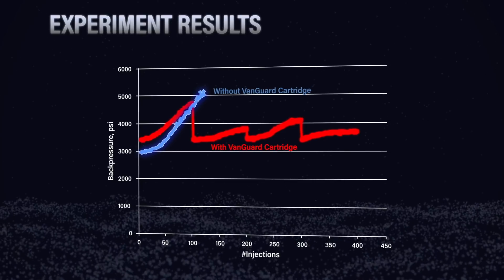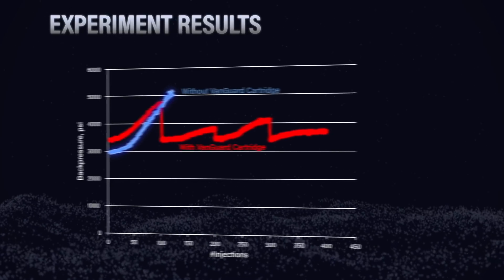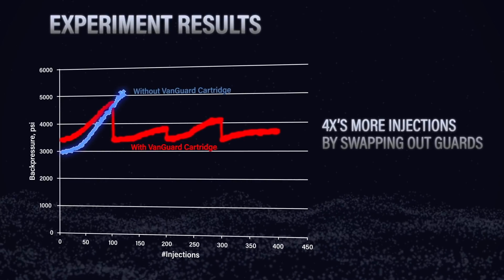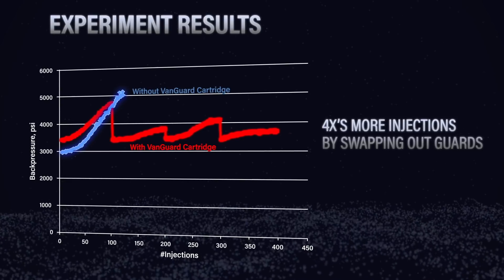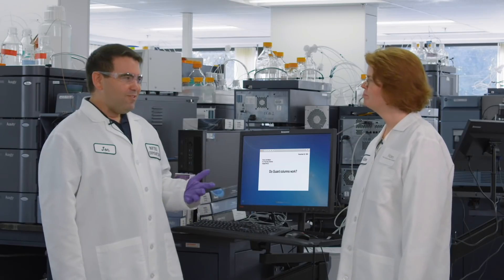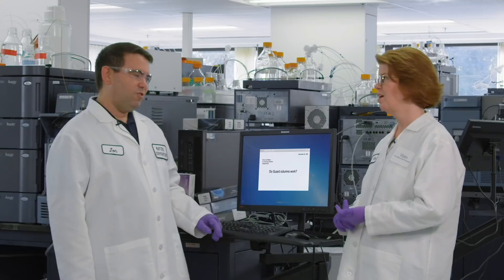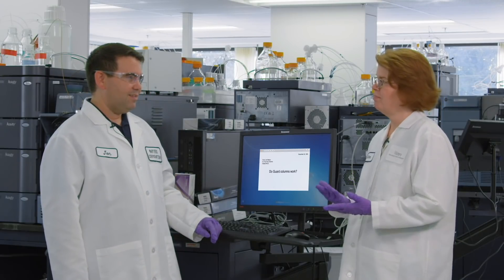So that guard cartridge was actually really helping with our analysis. We got about four times more injections just by swapping out the guard — so that guard really did add some value. This is a fun myth, Kim — a really good proof of concept. The guard looks to do what it was designed to do. I think this one is absolutely trusted. A guard column, when installed properly on the system and in the column, can really help you get more lifetime out of your analytical column.